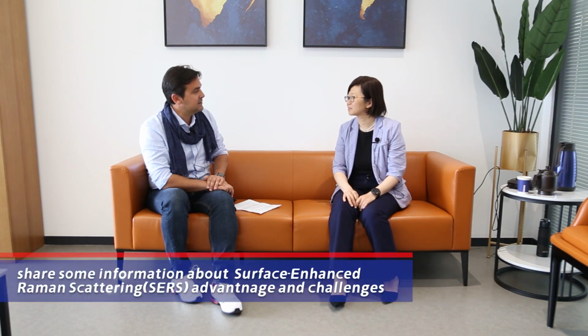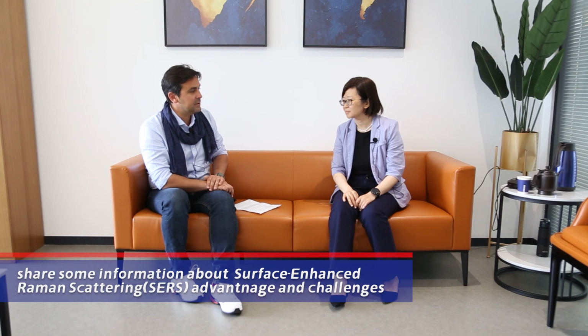Okay. I know that SERS has already been applied for quality control on foods and identification of drugs, thanks to the introduction on the market of handheld instruments like the Zolix ones, the handheld Raman spectrometers. Could you please tell us the main characteristics and the minimal specifications that you look for in such instruments?